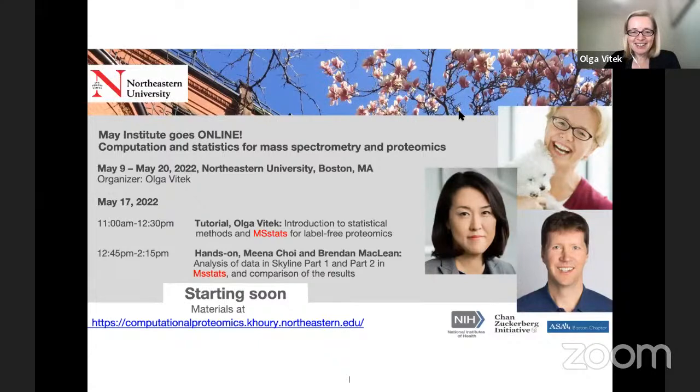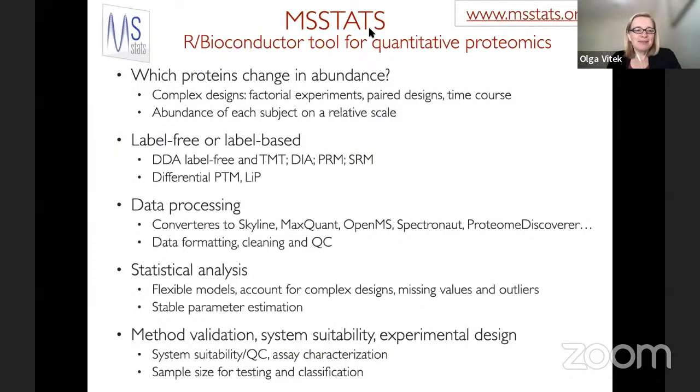So now we will go ahead and get started with the technical material. So I will jump in right away and let's talk about MSstats, what it is.